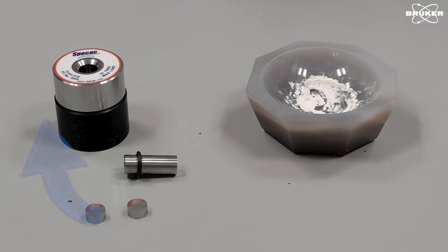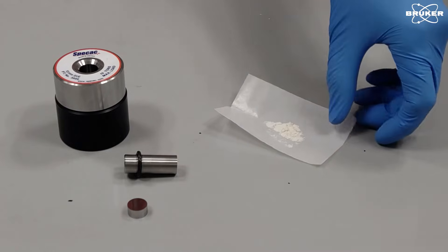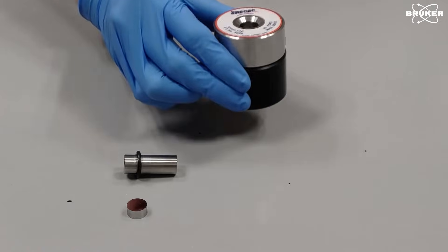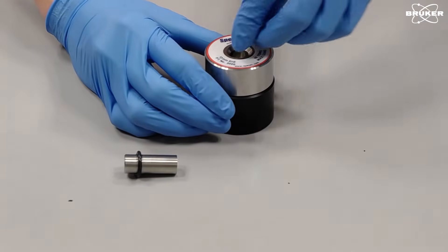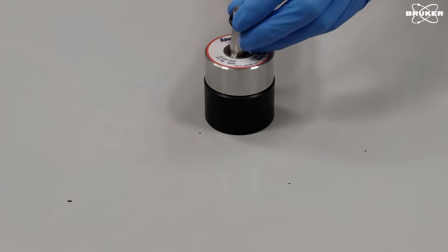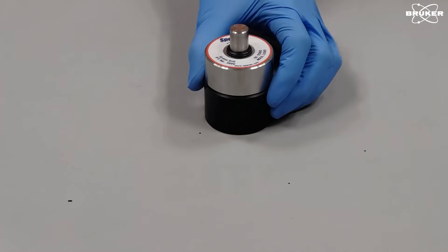Now insert the first pressing pellet. Next fill in the mixture. Compress the sample KBR mixture a little bit by tapping and insert the second pressing pellet. The plunger comes last. Now off to the press.